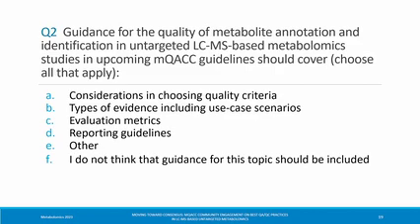Yeah, so I guess you could say mQACC is piloting a way to do this. Let me take that back. This has been done before in mQACC, but we are currently doing a survey on your identifications and annotations in NIST 1950 as a reference material for the purpose of obtaining consensus values.